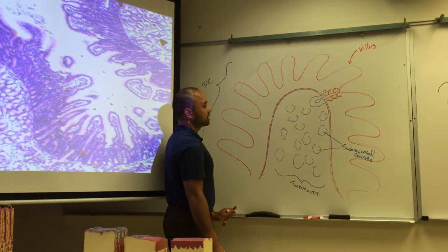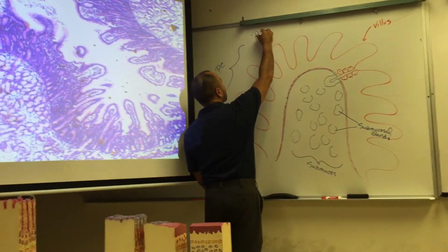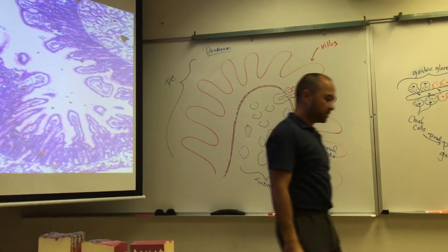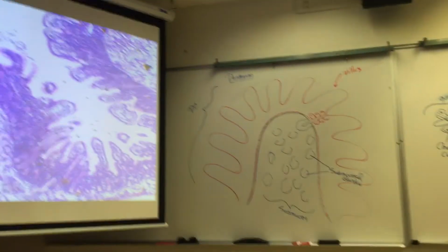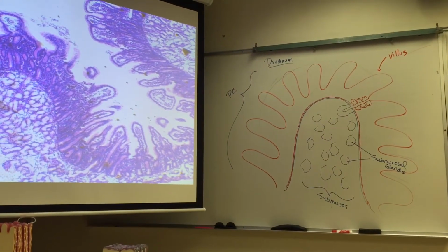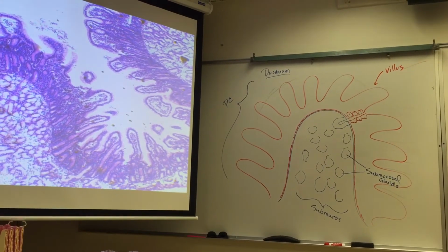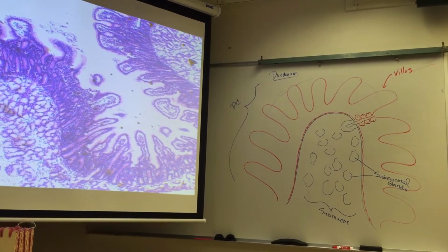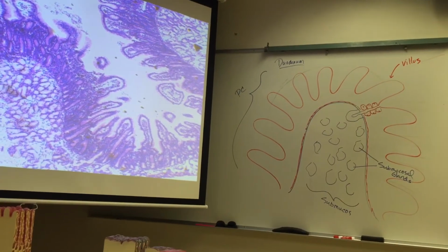Where are we again? Okay, which part? Duodenum, right? The stuff that the duodenum is receiving is acidic or basic? Very acidic from the stomach. Remember the acid chyme, right? Most ulcers actually form in the duodenum and the stomach.